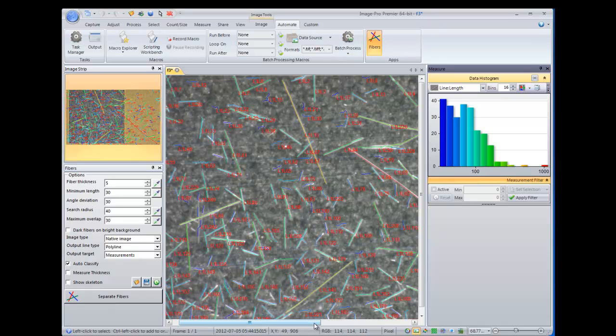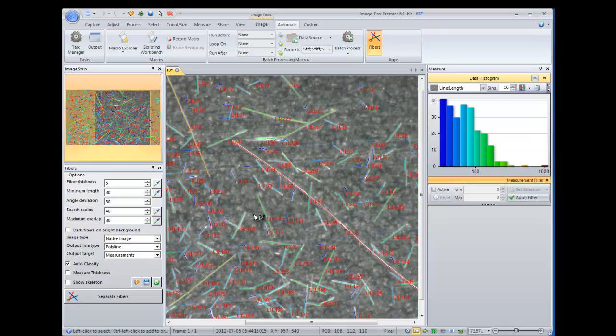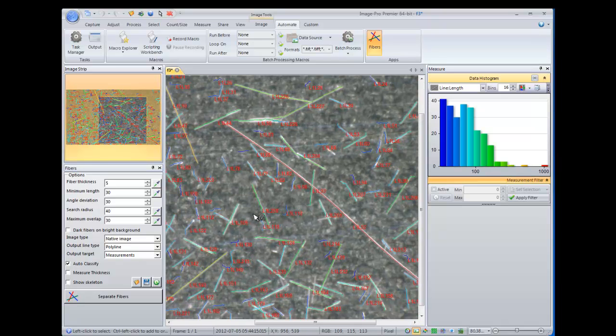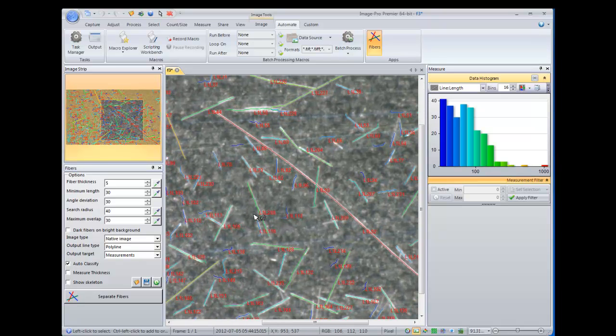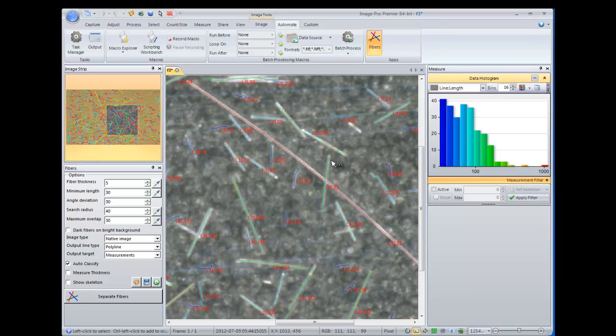Now this is a particularly tricky analysis step to do in most applications, in that most programs automatically would identify overlapping areas, such as this, as all being one object. But this app allows you to properly segment out all of the overlapping areas, and really identify them as two separate objects, which they are.